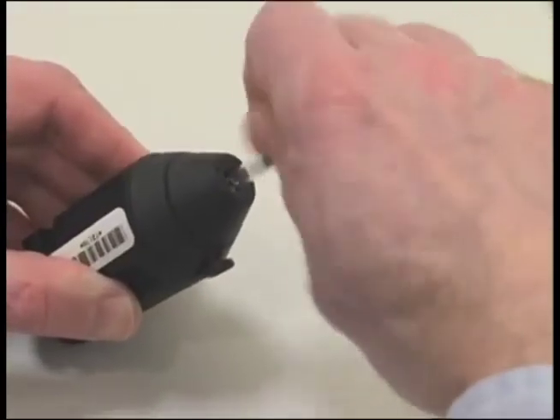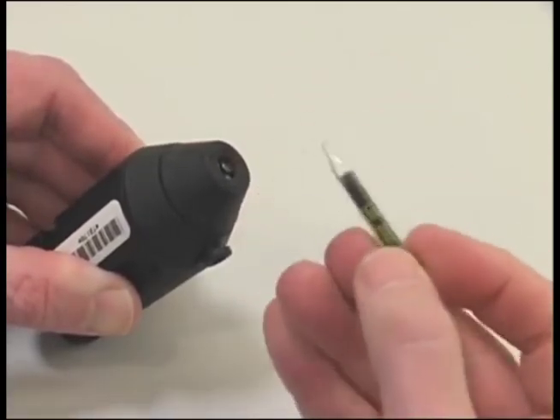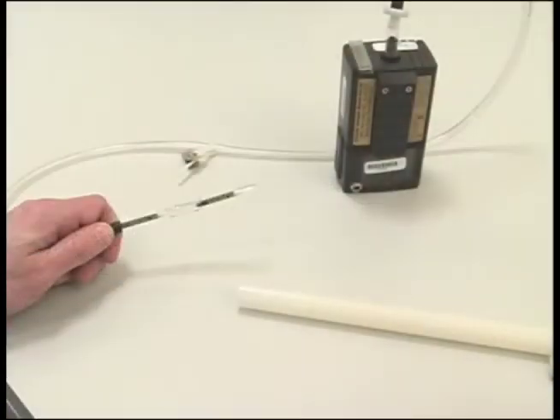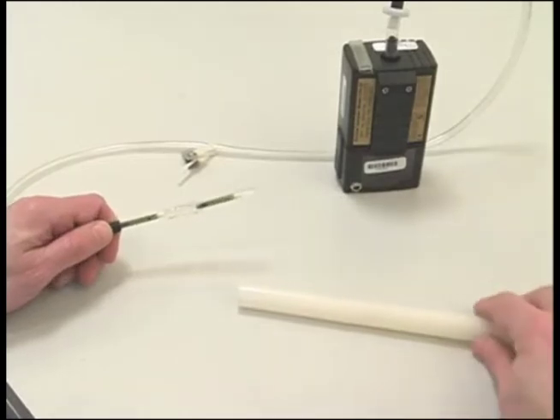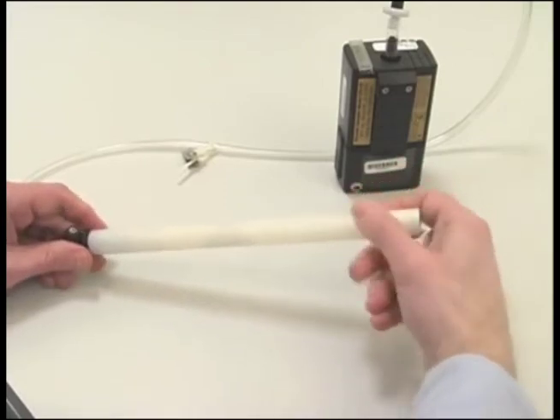Using a tube breaker, break both ends of the tube to provide an opening at least one half the internal diameter. Insert the open sorbent tubes just as you did previously, with both arrows pointed toward the pump. These sorbent tubes will be used for sampling. Place the appropriate size tube cover over the sorbent tubes and screw it in place onto the low flow holder.